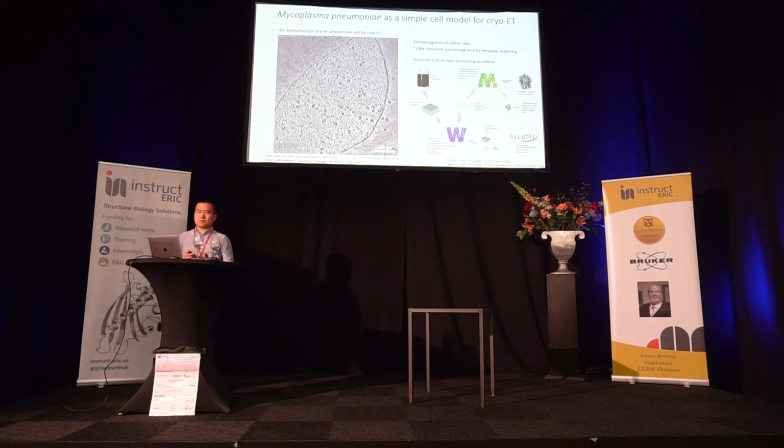Also, we worked together with Dimitri Tegunov from the Patrick lab to establish and validate a new image processing workflow that can link WARP, RELION, and M. So it really unifies all the image processing steps.